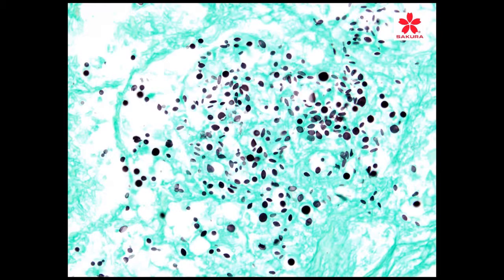Years ago, when they first came up with special stain instrumentation, I was very reluctant to use them because of the nature of silver stains. Silver stains have to be monitored very closely. They have to be cut off at a certain time. And so that was very difficult, even from a manual perspective.